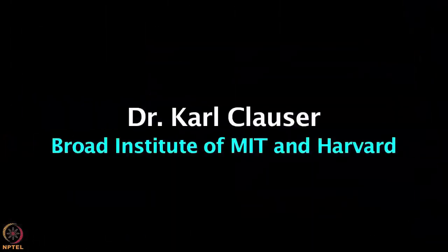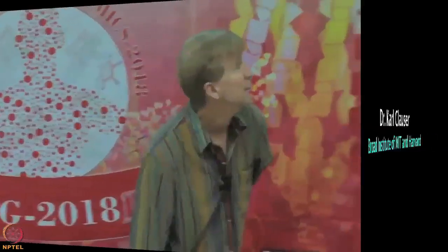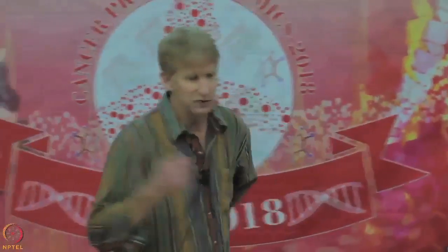Extra things might be possible to use in reducing your list to the confidently assigned peptides. Some scoring systems are going to be used, but we're almost never these days going to collect one MS spectrum at a time. We're going to stick it in a machine and the machine's going to keep generating mass spectra as long as it can.